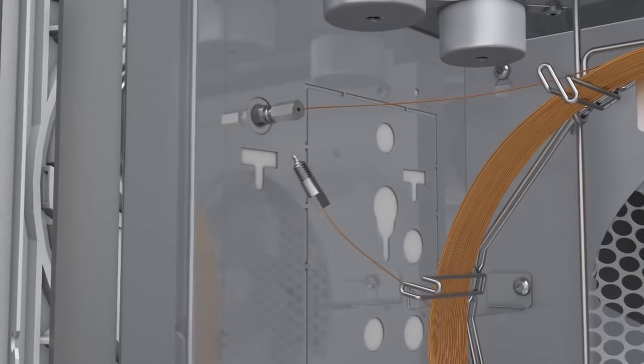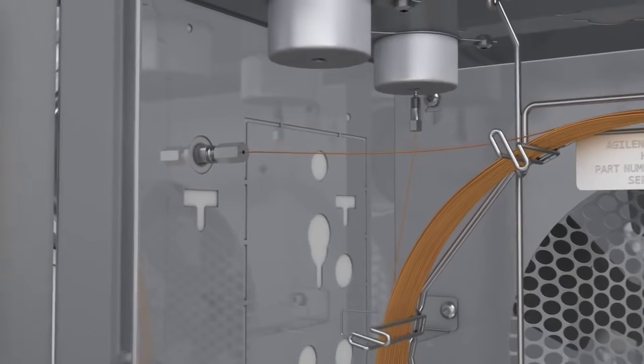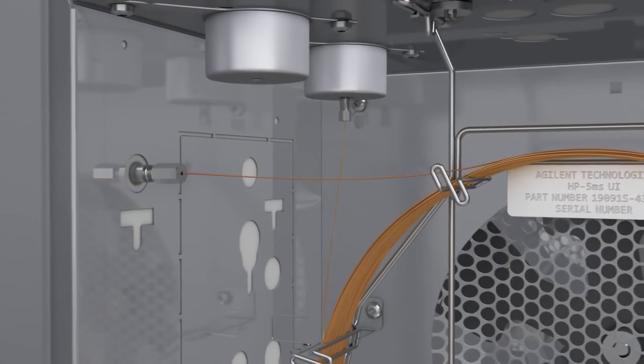The flexible metal ferrule is securely fixed to the column, keeping the measured length of the column. This is critical for the most accurate and reproducible data.